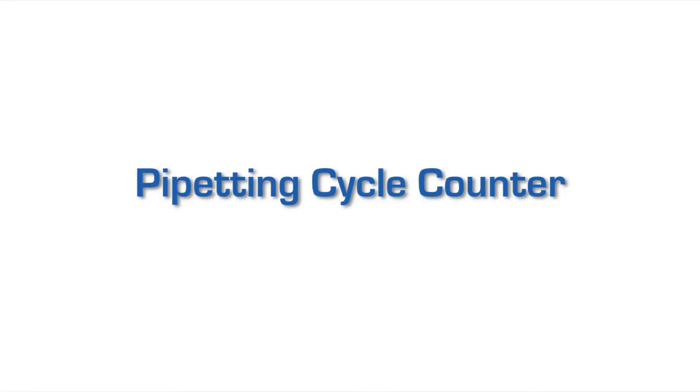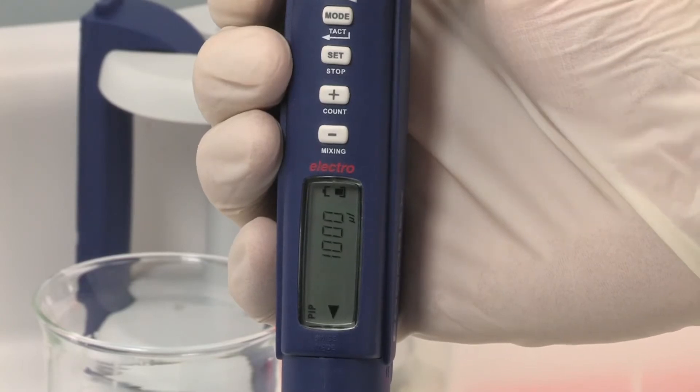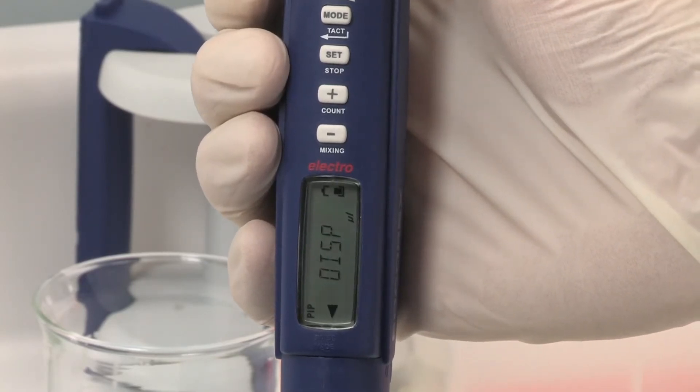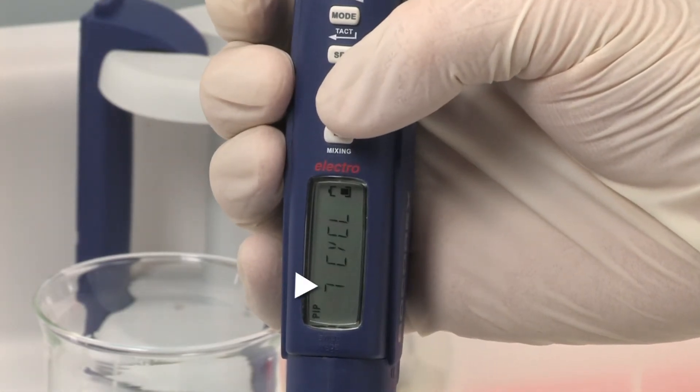The cycle counter shows the number of aliquots in a sequence or displays a reminder for maintenance and/or calibration. Each cycle includes a full aspiration and distribution. A simple double-click on the plus key gives access to the number of pipetting cycles performed since last zeroing.